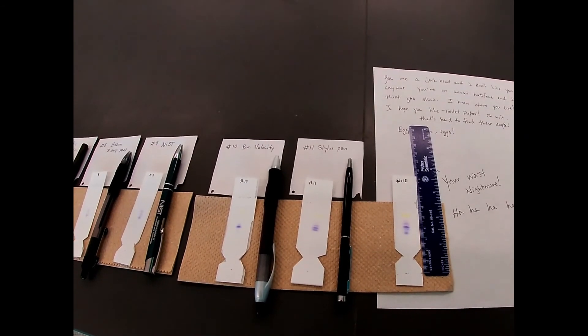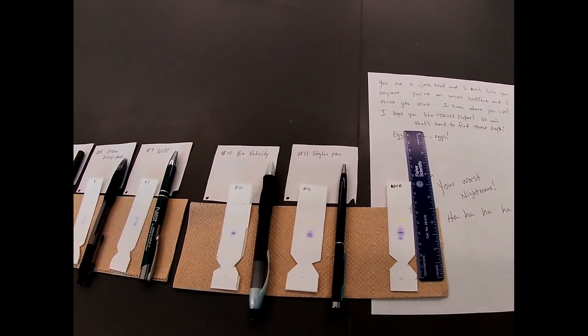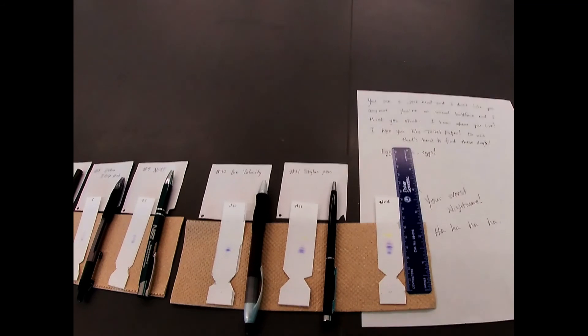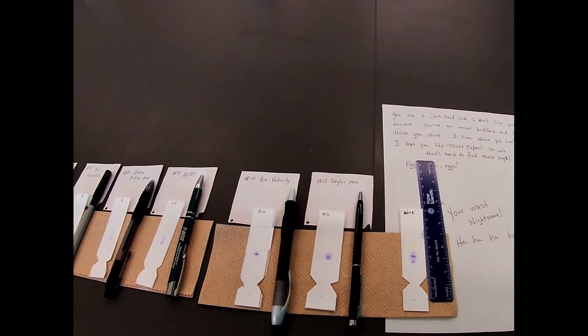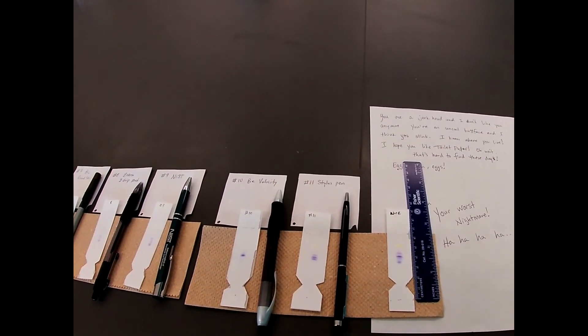I'm going to post all of the data. I will not calculate the retention factors for you, but I will post them on Blackboard so that you can do your retention factor calculations and your analysis.